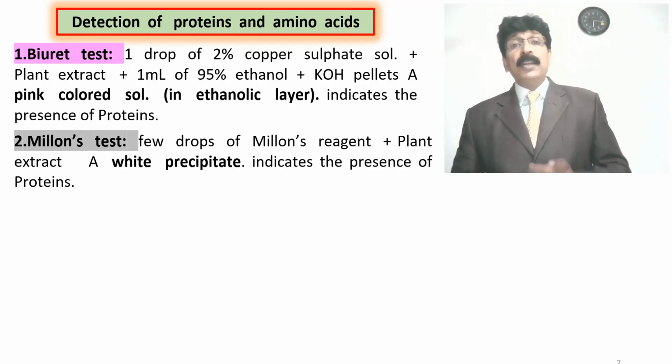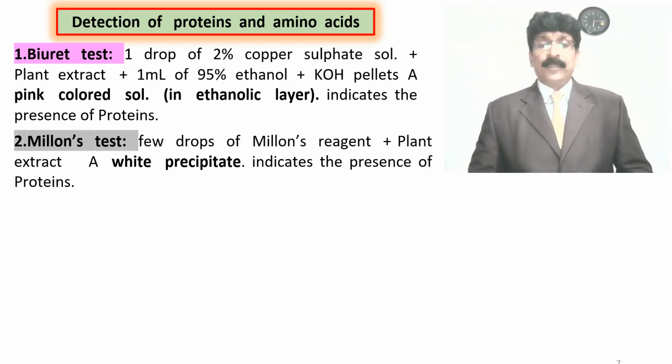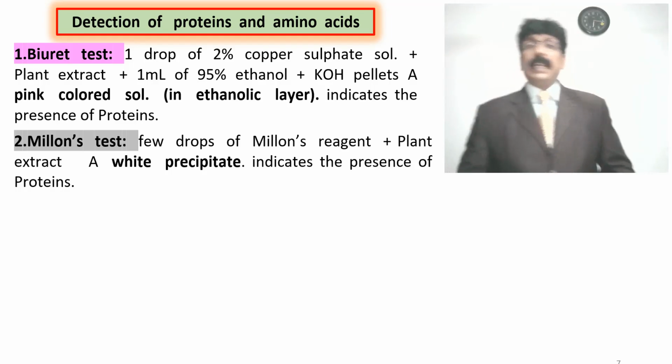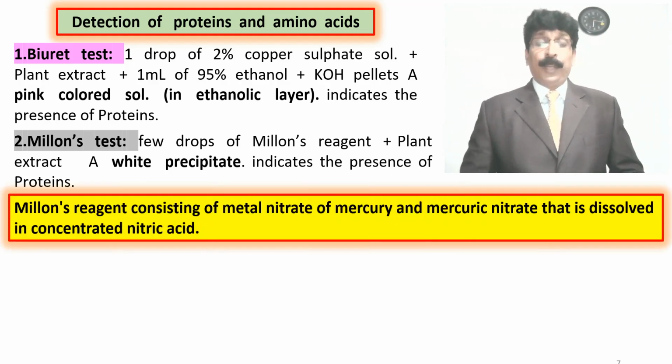Number 2, the second test, Millon's test. Few drops of Millon's reagent plus plant extract, a white precipitate is formed, indicating the presence of proteins.